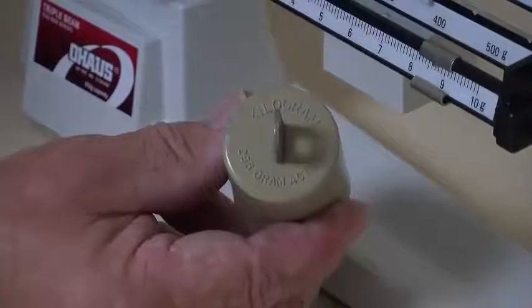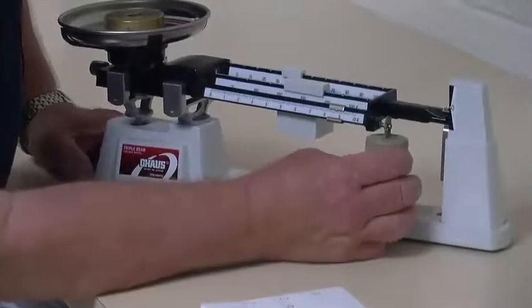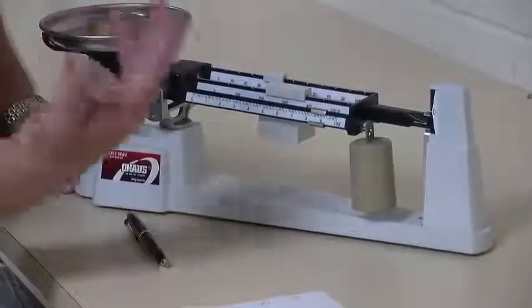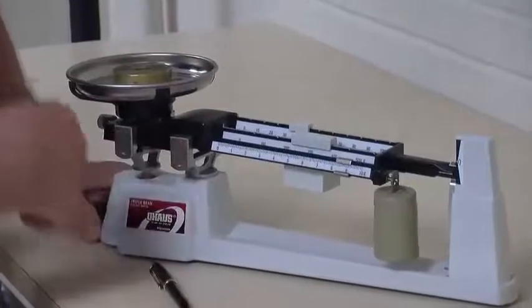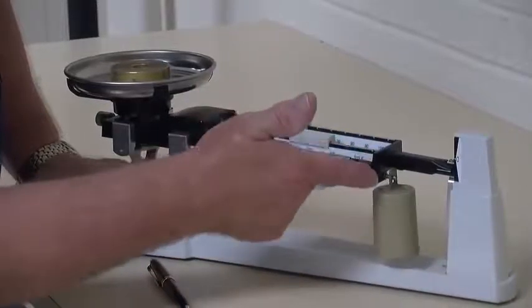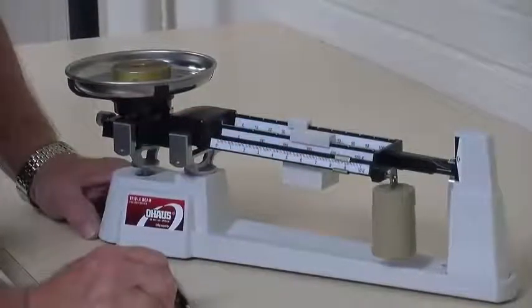What that means is the 295 gram mass of this auxiliary weight this far from the balance will counterbalance a kilogram here in the pan this far from the balance. So whenever you have to use this, you add the larger number to the masses on the three poises.